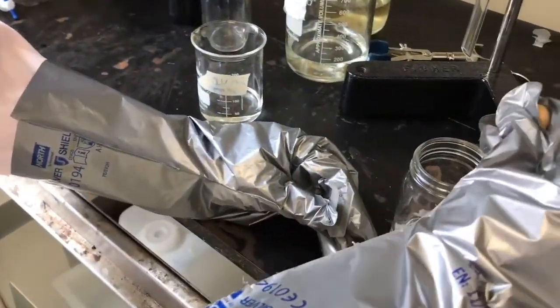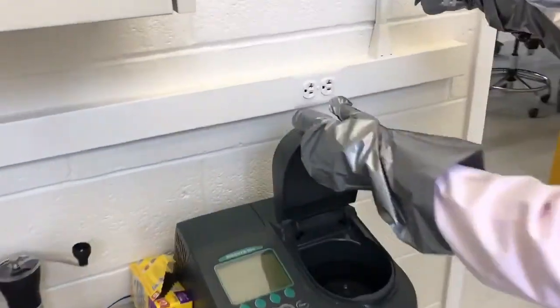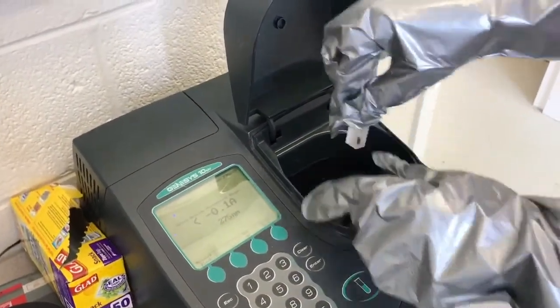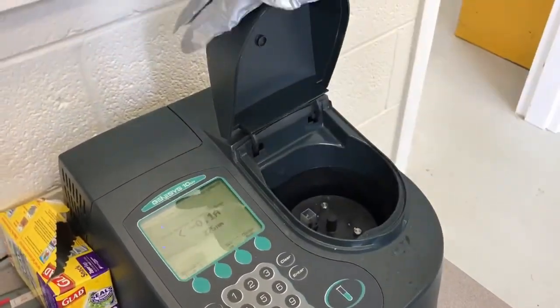We then transfer the clear dichloromethane phase liquid into a quartz cuvette and place it into a spectrophotometer. After it's placed in nice and gently, we record the absorbance at 275 nanometers.